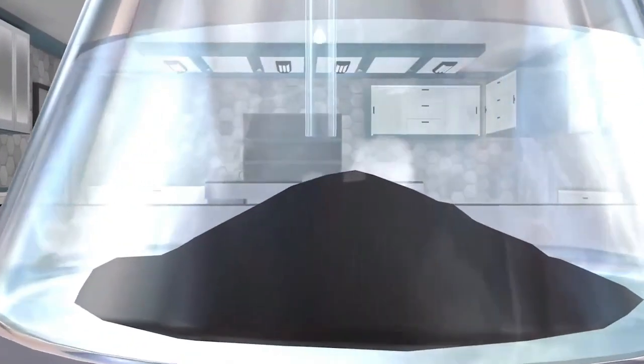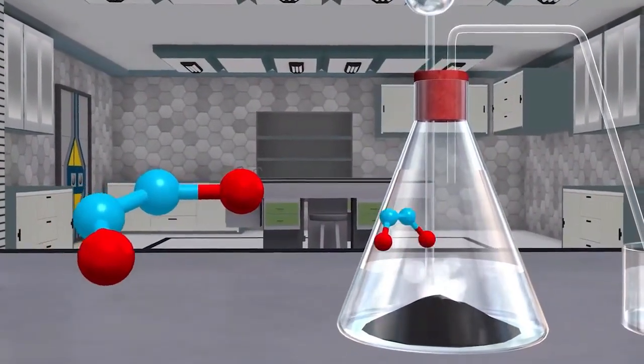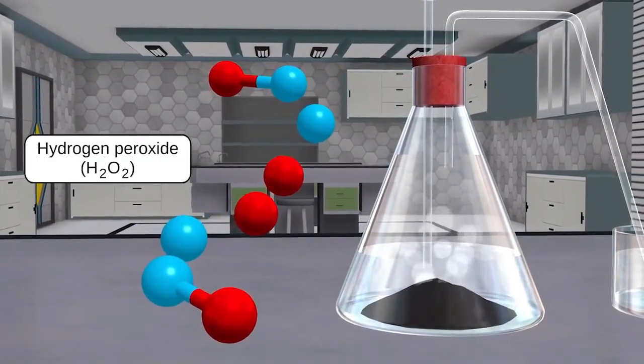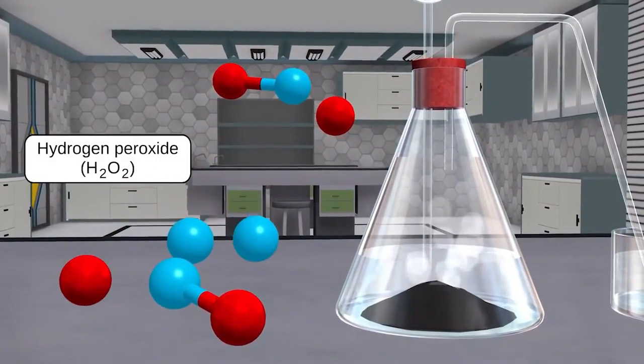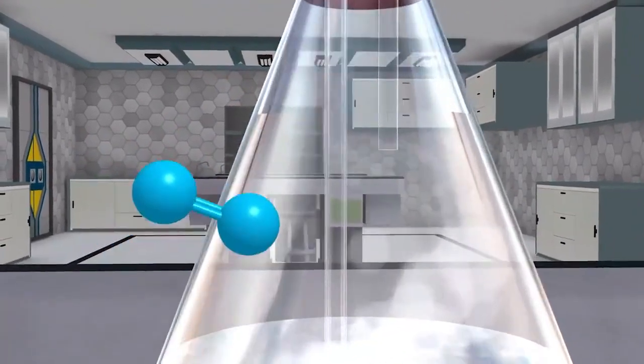As the reaction begins, we will see the release of oxygen gas which will be collected in the gas collecting apparatus. Finally, after a few minutes, we can observe the oxygen gas that has been produced in the form of bubbles in the test tube.